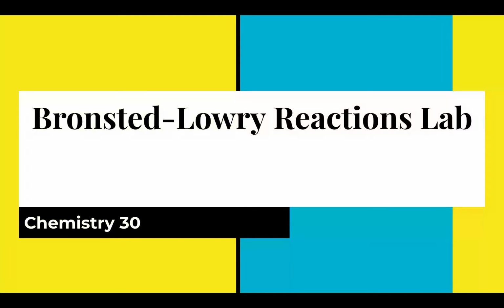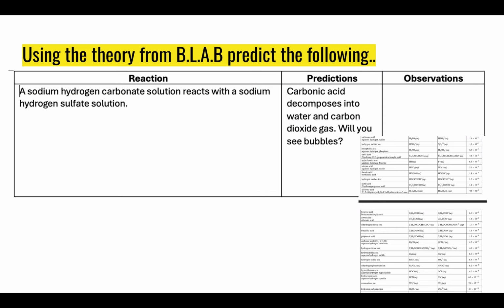Okay, so yesterday in class we learned about Bronsted and Lowry, and today in class we did a lab. So I picked a few reactions that we could visually see just to show how Bronsted and Lowry works and how we can predict. So the first example we took a look at was sodium hydrogen carbonate reacting with sodium hydrogen sulfate. So just like before, if you're predicting a reaction, you want to write down everything that is present.